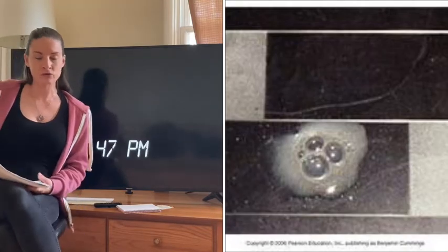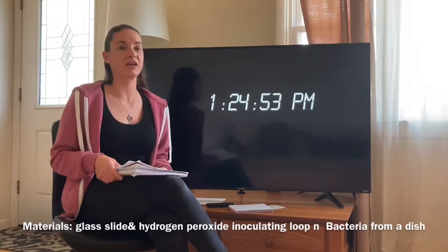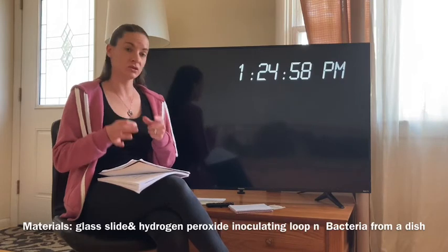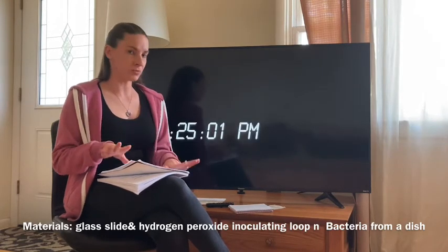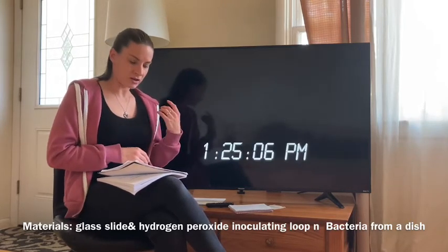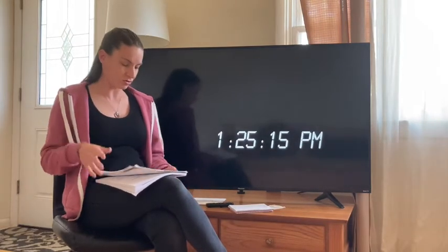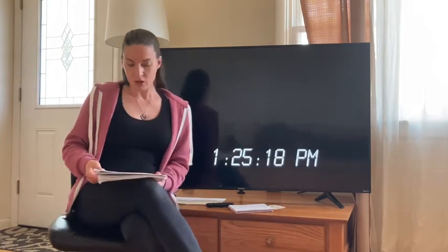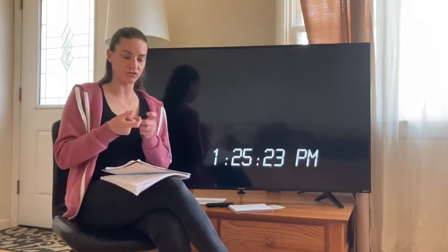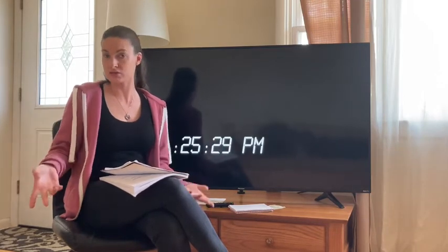So how you do this test is you get a slide, and when I say a slide, I mean the slides that you use to put under the microscope, but you're not using the microscope for this test, you're just using the slide. So you get the slide, and then you take 2 to 3 colonies. You can get plenty, like you can get more than that, but you only need 2 to 3 colonies. Put it on the slide, and then it'll be in this little dropper bottle, and you get the hydrogen peroxide, and you just drop it on top of the bacteria on the slide.